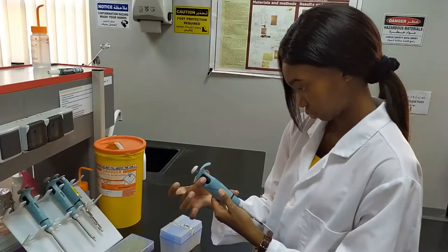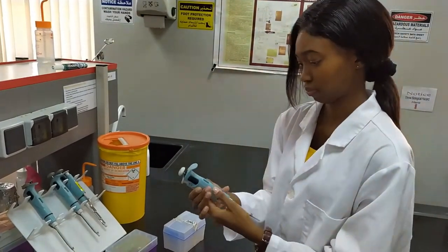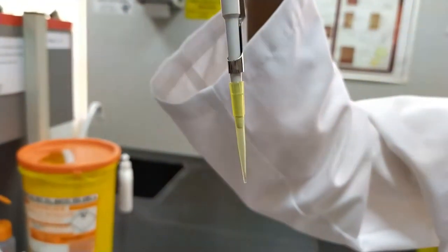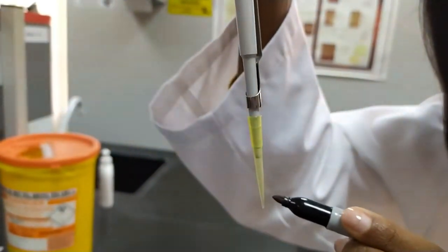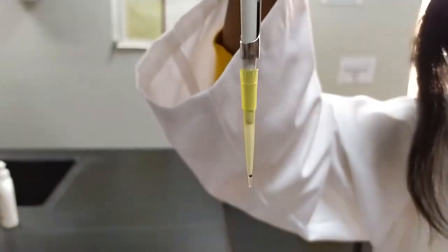Next we're going to have her change the volume to the lowest setting on a P20. So we're going to set it to two microliters. And she's first going to use correct technique to help her mark the outside of the tip to show where two microliters should be on that tip.